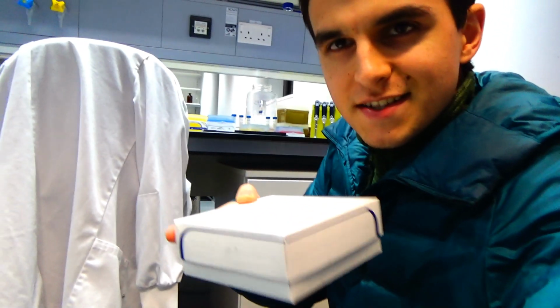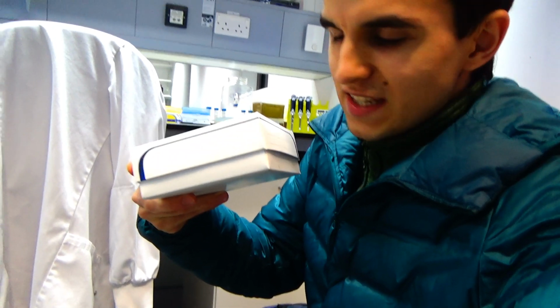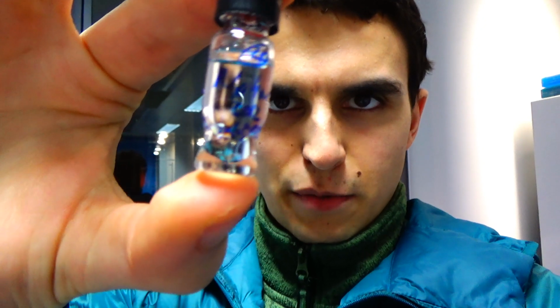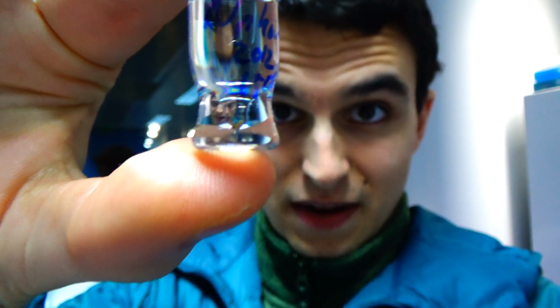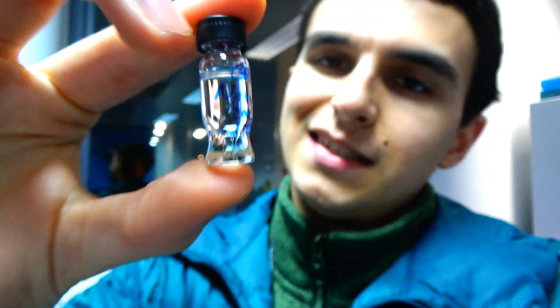That's what's inside this box here. Inside this box here are about 40 tiny butterfly brains. So inside each one of these little containers is a butterfly brain, which I've since realised is going to be almost impossible to film, but I can just about see it at the bottom of that little container here. Can you?